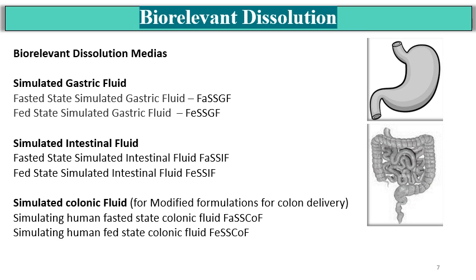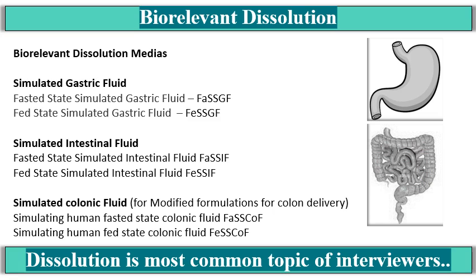Then coming to the biorelevant medias, mainly two biorelevant medias are used, that are simulated gastric fluid media and simulated intestinal fluid media. Now simulated colonic fluid is also available. These are available in the fasted and fed state. So mainly for the fasted study, fasted media is used, and for fed study, fed state media are used.